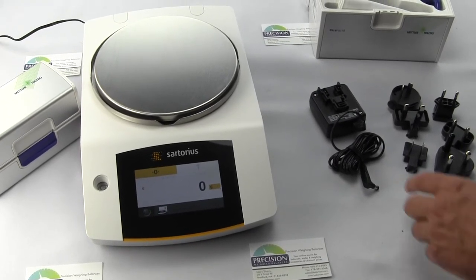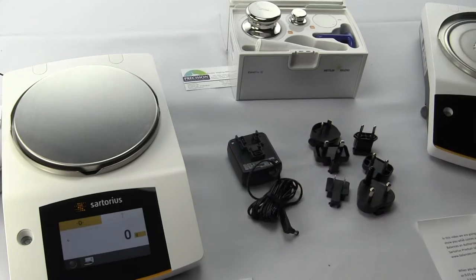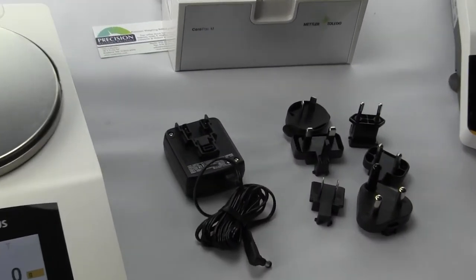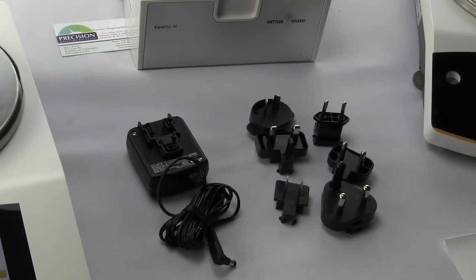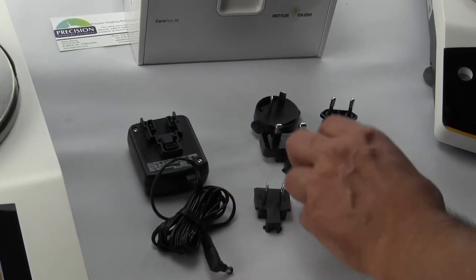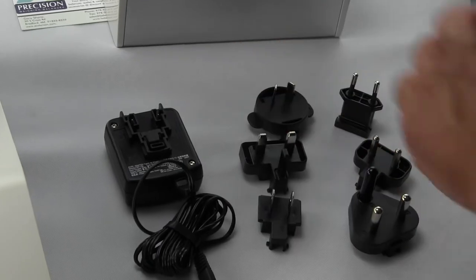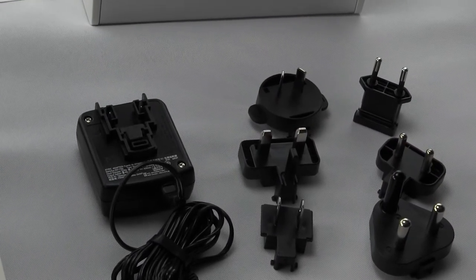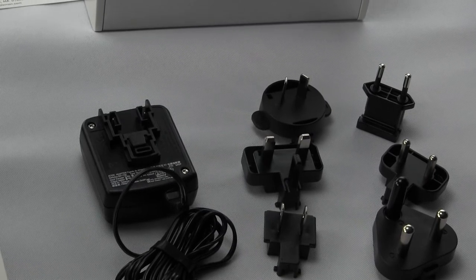Let's discuss this universal adapter one more time. This is Sartorius part number 6971790. When you receive it, it comes with six adapters for different countries: the US, Europe, the UK, Australia, India, and South America.